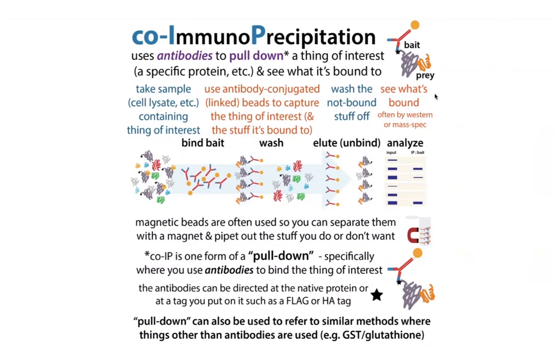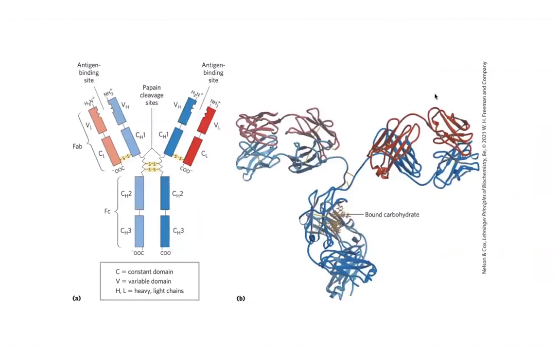And so again, we're going to be going over a couple examples in this video, and then we'll be going over a lot more in class, and you guys will get practice working with them and interpreting the figures. But let's start with what is an antibody.